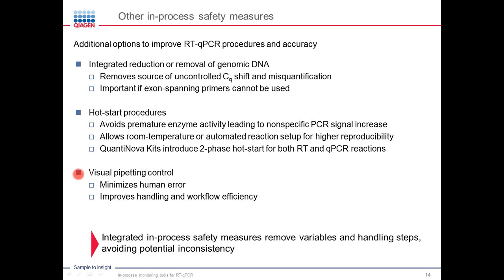And the last point I would like to show here is a very simple tool, which is a visual pipetting, just to make sure that we can see when adding reagents to each other, there's a color change that is easily visible, and particularly when working in 96 well or 384 well setups, this comes very useful to avoid human mistakes while pipetting or taking away stress.